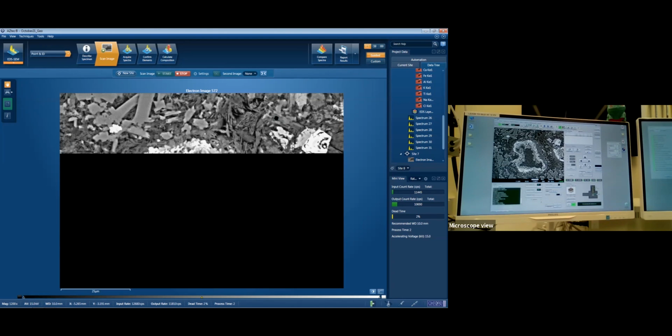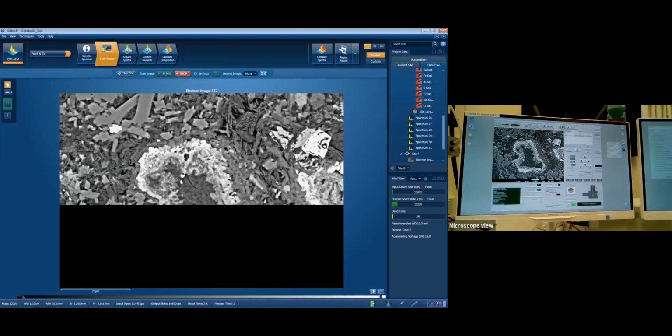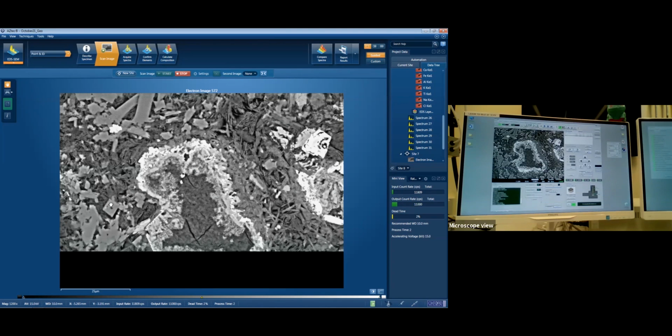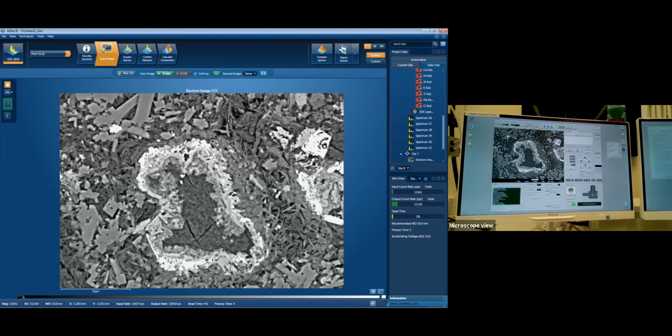Zooming in all the way again, and we'll leave you with this one. So we've got these nice sort of cube minerals and these nice sort of well-formed crystal shapes. We call these euhedral, which just means they're formed really nicely. They're about as perfect as you can get.